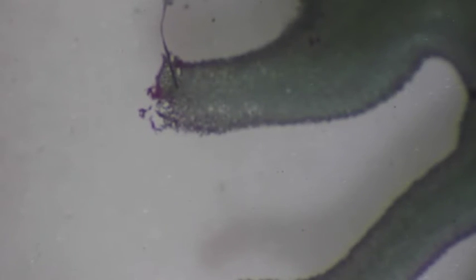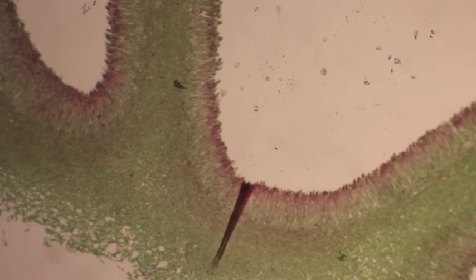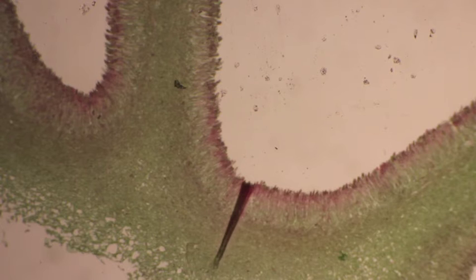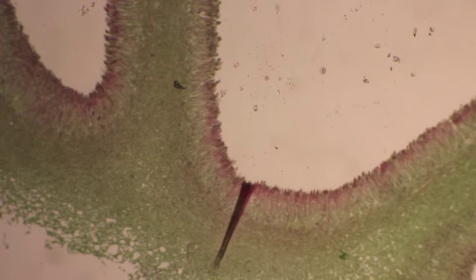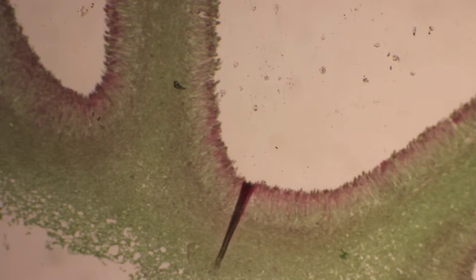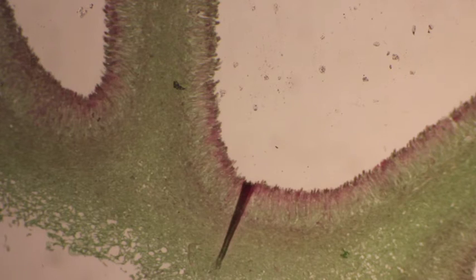We're going to be looking at the spores right on the inside edge of one of these cups. I'm going to transfer this to a compound scope. We're going to see the cup part of this mushroom, and lining that are sexual spores — that's what we want to look at to identify this organism.